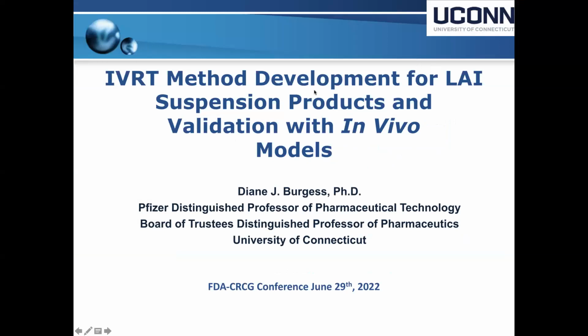Hello, everyone. So I'm going to talk on IVRT method development for LAI suspension products, and also the validation of that by using some in vivo preclinical models.